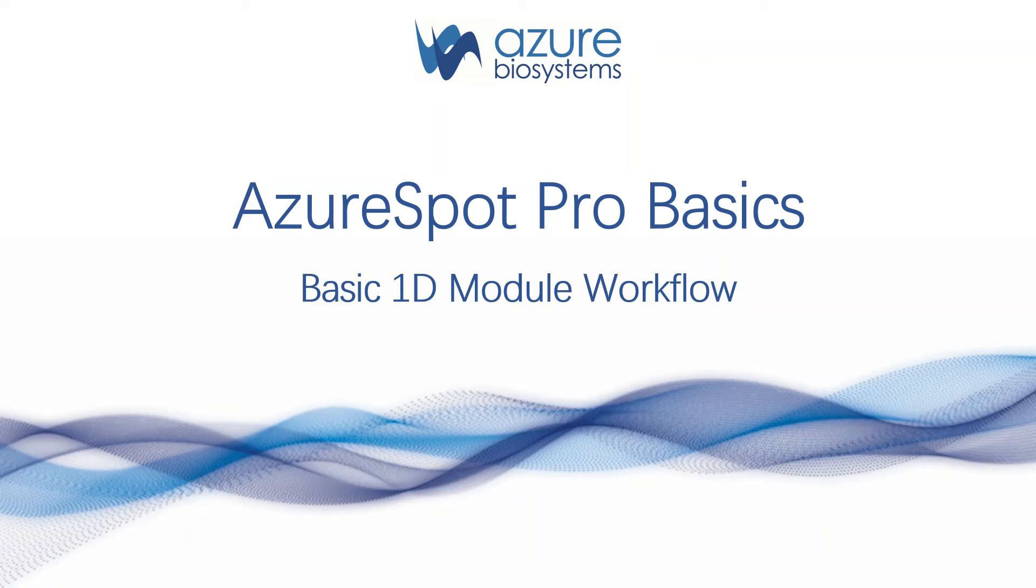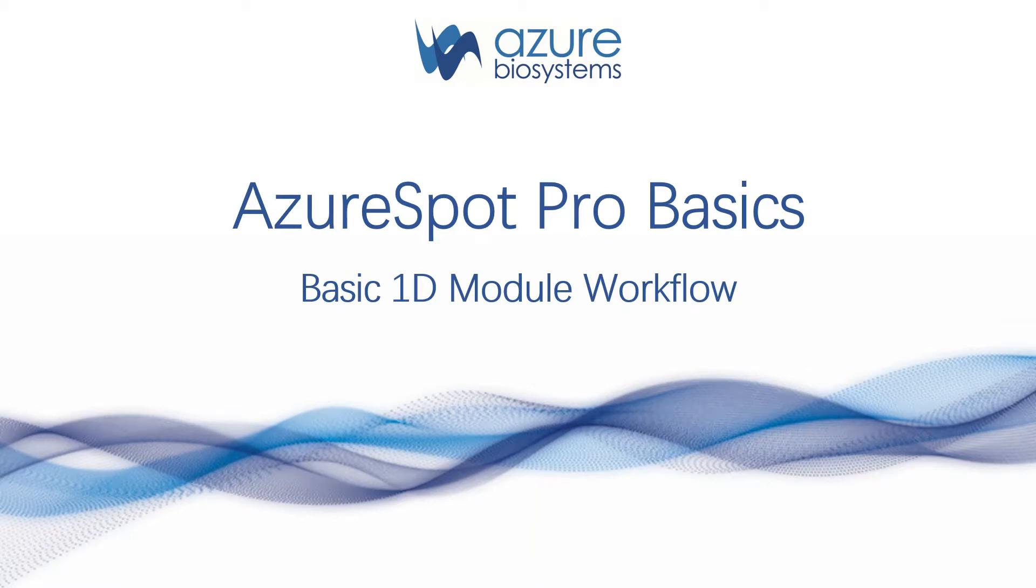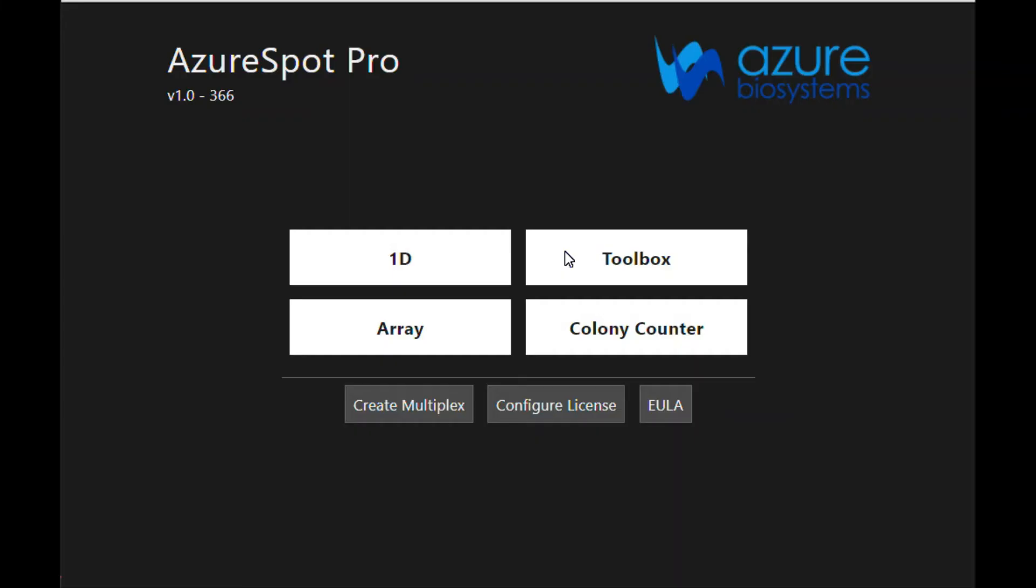Hi, this is Azure Biosystems and today we are going to cover the basic 1D module workflow in the Azure Spot Pro analysis software from Azure Biosystems. Azure Spot Pro analysis software offers modules for 1D analysis, array analysis, a colony counter, as well as a toolbox analysis module. Today we are going to cover basic analysis using the 1D module.